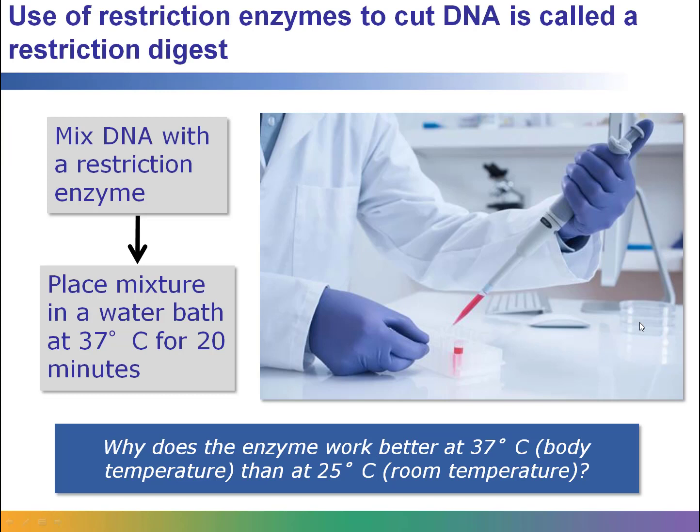All right, so we're going to start here. In a restriction digest, the restriction enzyme that you choose is being used to cut DNA into fragments. Those fragments are called restriction fragments, sometimes DNA restriction fragments. Essentially, we're just cutting up pieces of DNA. You can use many types of enzymes. For example, we know there's EcoRI that was found in E. coli. There's also one called BamHI and HindIII. There are over, I think, 600 commercially produced restriction enzymes that all cut at very specific sections of the DNA, and they're all going to cut at different sections.